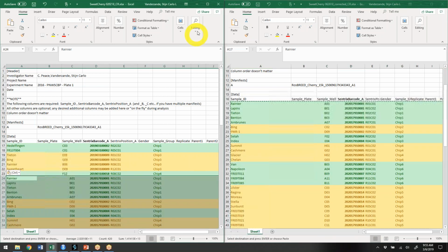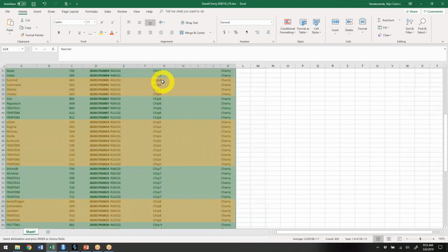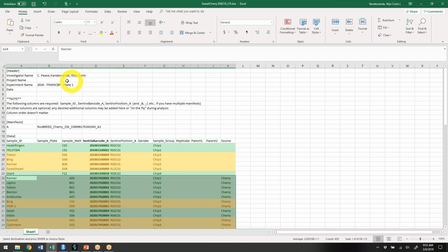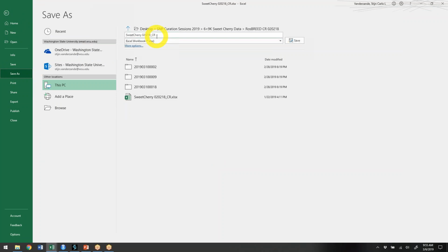And then I just copy everything in this one file. So this now houses all the data that you have. It holds all the references, telling us for all the samples that we have where to find them. And now I'm going to save this as a new file because I want to keep the old file.